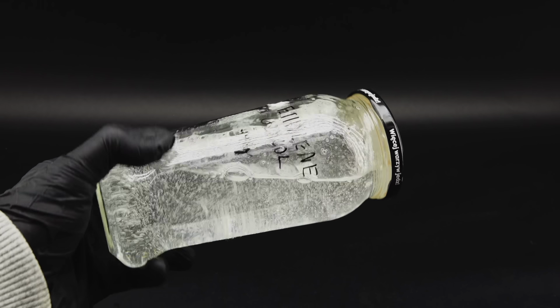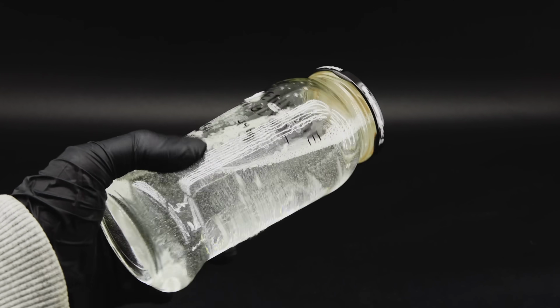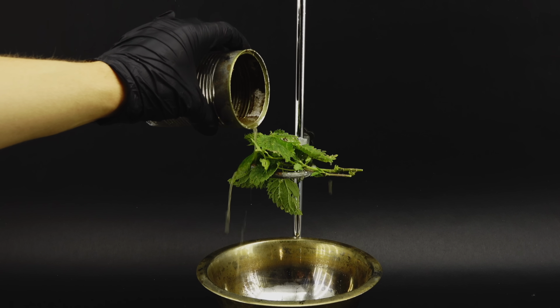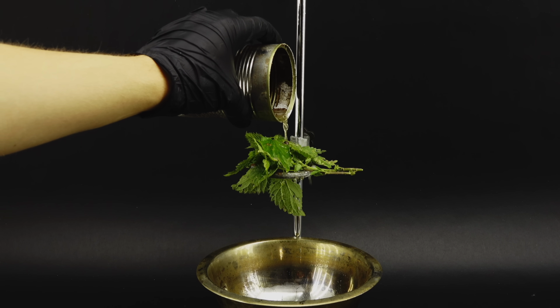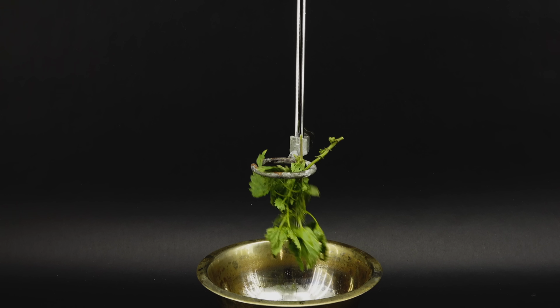With the glycol ready, I now have to come up with the setup for making the benzene, and this is where things get rather tricky. You see, a concentrated solution of sodium hydroxide at nearly 200 degrees Celsius is, let's just say, dangerous, and it can eat through things like flesh and glassware in no time.